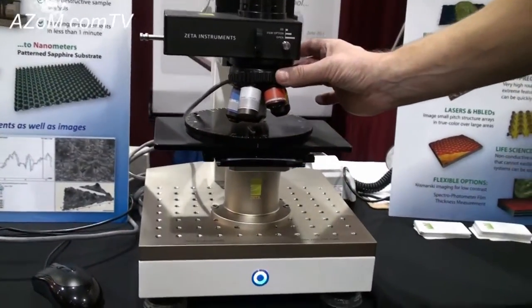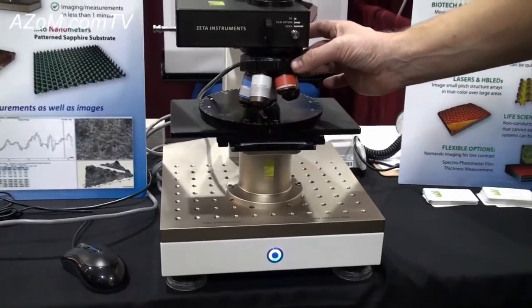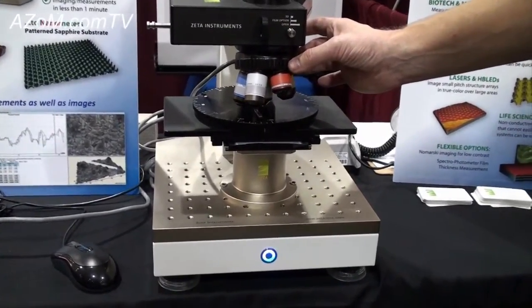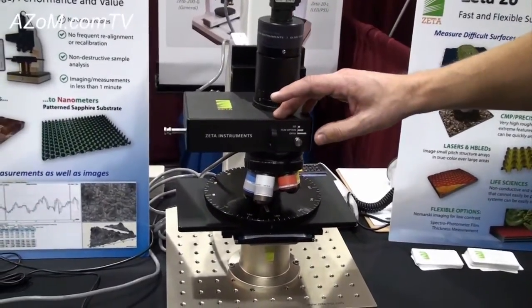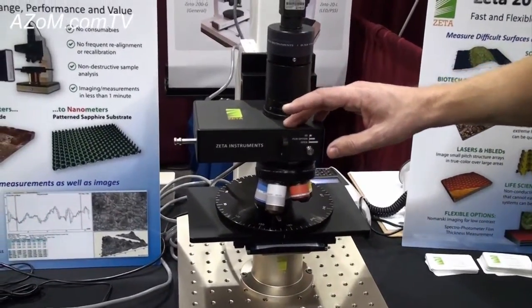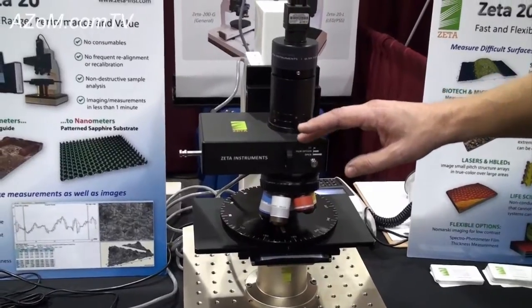We have our standard objectives which cover a range of 5X up to 100X. We have our technology that allows us to enhance the image and the resolution in the Z direction over that of a standard microscope system.